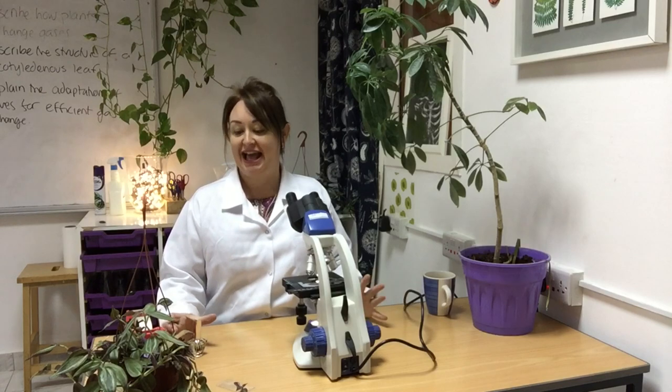Today we're looking at the gas exchange features of a leaf, which means we have to look at stomata and their guard cells. There are several ways of viewing them, and if you're at A-level doing this experiment, what we want is an evaluation of which method is the best, limitations of each method, and explanation around that.